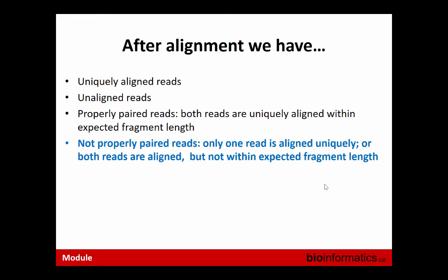So imagine one read is aligned on chromosome 1 and second read is aligned on chromosome 17. And we see this, they both align, everything is okay. So this can be alignment error because we have synteny between different genomic regions, and with a couple of mismatches we can place better. Remember that alignments are heuristic, right? They kind of try to place read better.